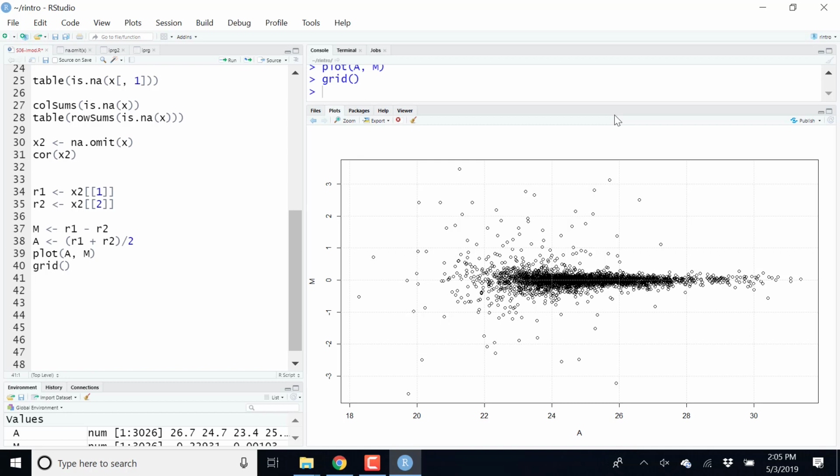Here on my y-axis I have my log fold change, and here I have my average expression. We look at whether my fold changes are centered around 0, and how far away. These are replicates, right? So here I don't expect to see any changes. And the spread of these fold changes will be a much better indication for me whether these replicates have been successful and to what extent my experiment is replicable.